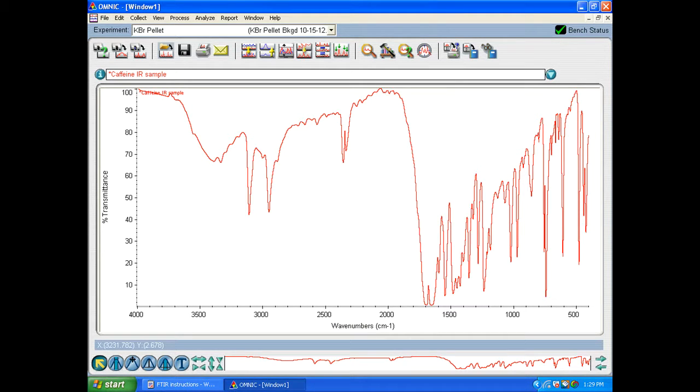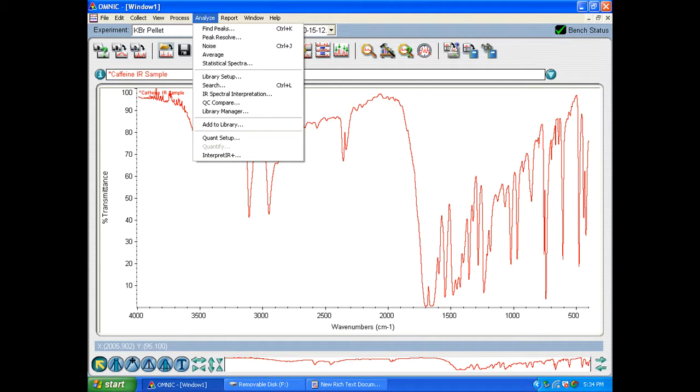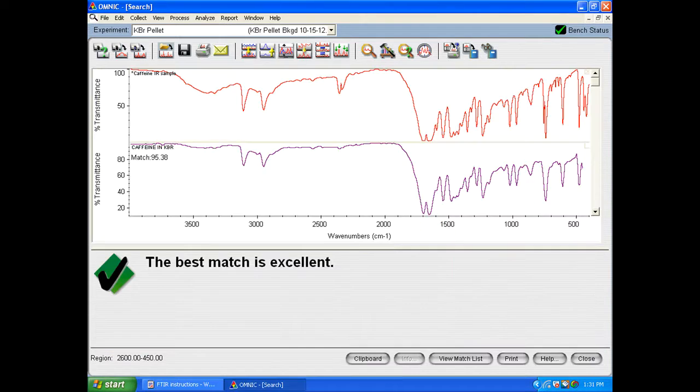Now if you're in the forensics class and you're wanting to go ahead and look up whatever compound it is you have, all you have to do is go to analyze and then you go to search. The library that this OMNIC program has access to will try and match the spectra to the closest thing possible. So in this case we get this where the software is showing us yes it found a match that this is caffeine in KBR and the best match is excellent.